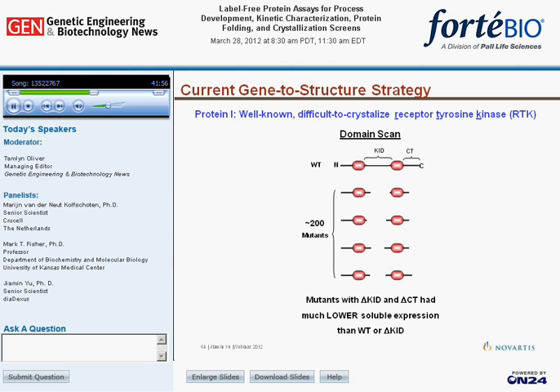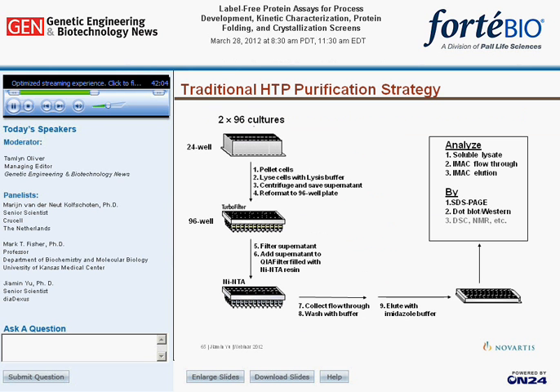The His tag on all constructs allowed one to quickly purify the target protein on small scale using the QIAGEN system. The soluble lysate, IMAC flow-through, and the eluate were then analyzed by SDS-PAGE, followed by Western or dot blot. Typically, this process took about 3 to 5 days, depending on the number of constructs and FTEs.